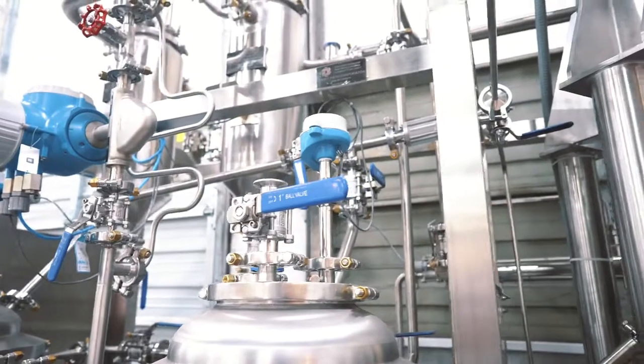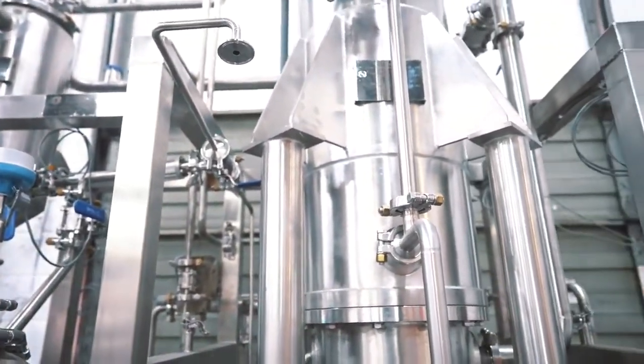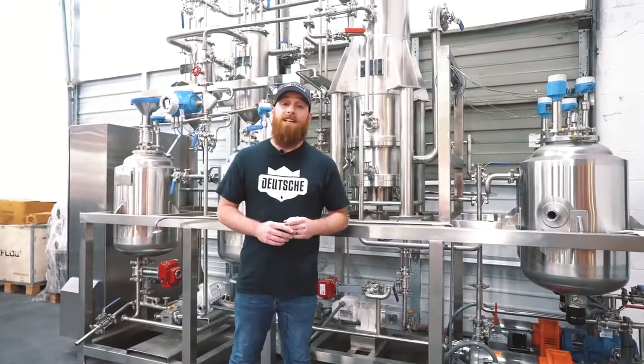These together combine to allow for the efficient separation of high molecular weight, thermally labile distillate products. Our systems are single-pass designed, but a second pass can be done to increase the potency.